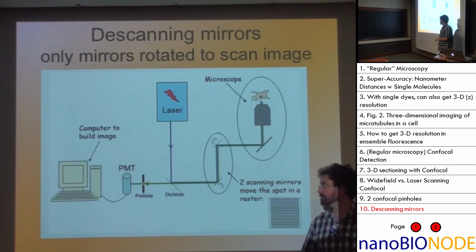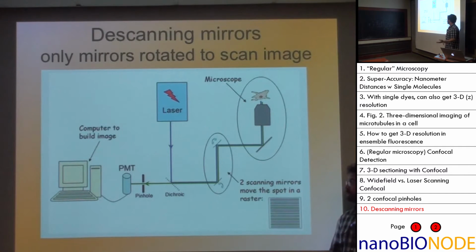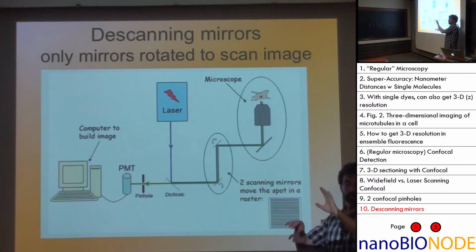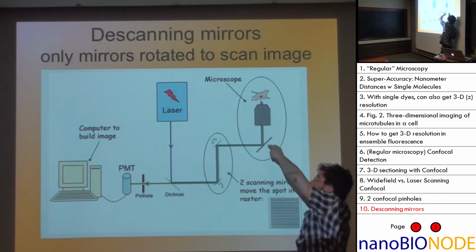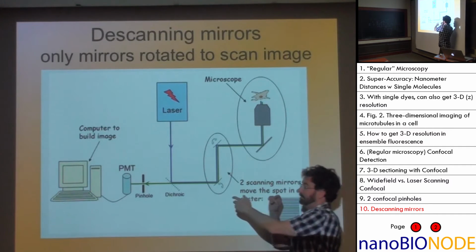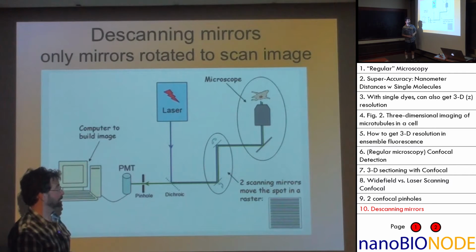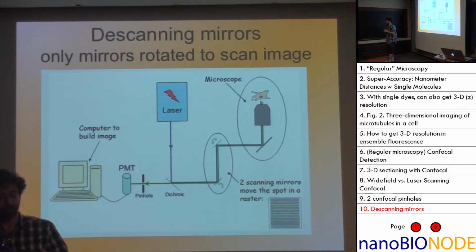And it turns out that you can actually excite not only with one spot, but let's say you have two lasers there, and you excite at two spots, and then you have not one pinhole, but two pinholes there. Well, what about three? And what about four?